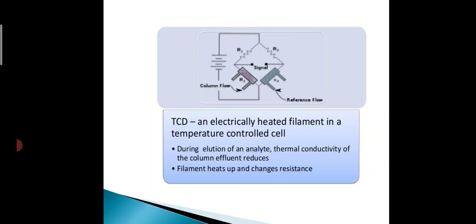When the resistance values in the circuit are equal, the bridge is in a balanced condition. Any change in the resistance value causes current to flow in that circuit, and we have fixed a meter to indicate the value of this current flow.